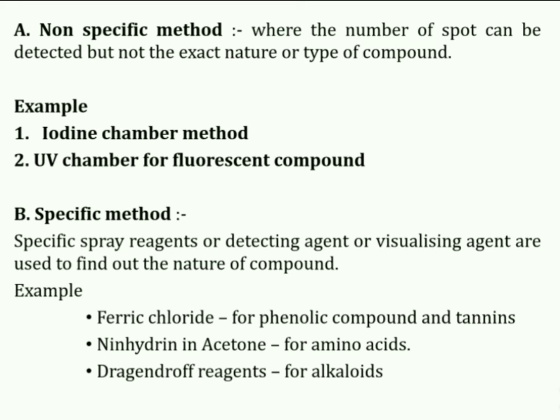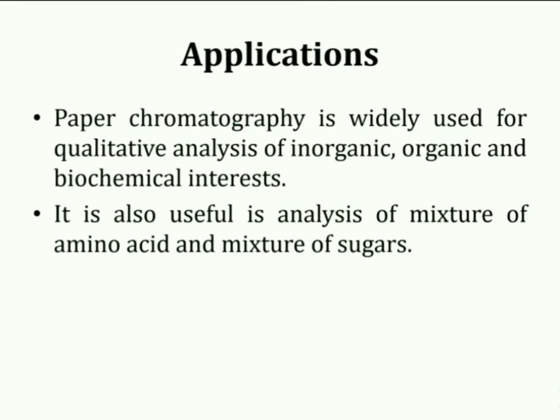Applications of paper chromatography. Paper chromatography is widely used for qualitative analysis of inorganic, organic, and biochemical interests. It is also useful in analysis of mixtures of amino acids and mixtures of sugars.